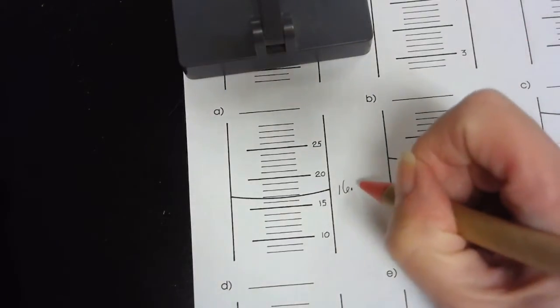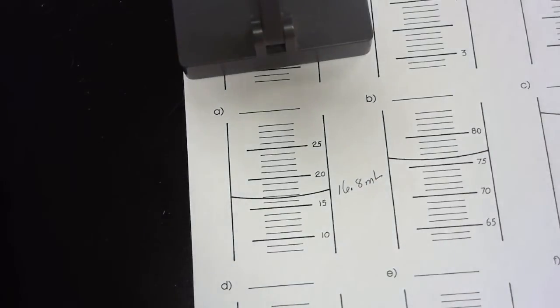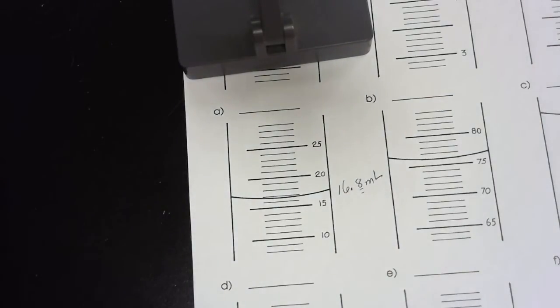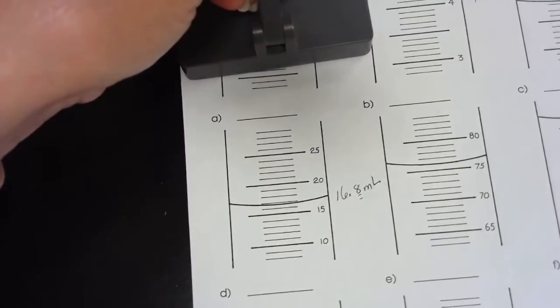I don't know. I'm just going to say 16.8 milliliters. You may have said 16.9, 16.7. Again, as long as you're showing me that you're doing your best to reasonably report that last uncertain digit there.